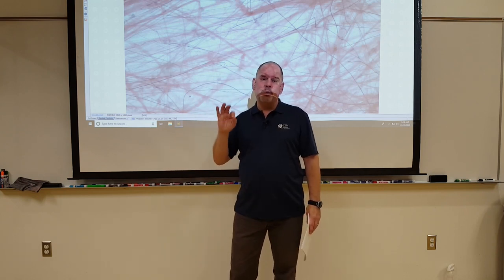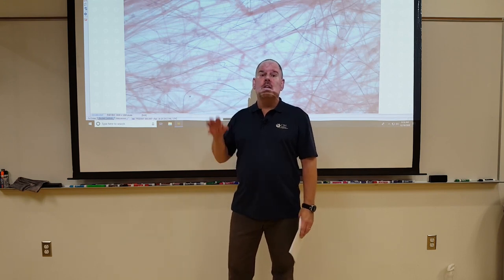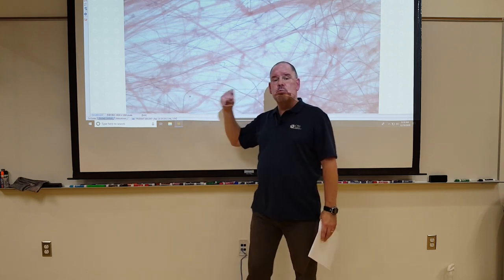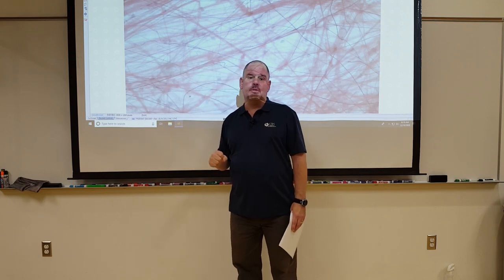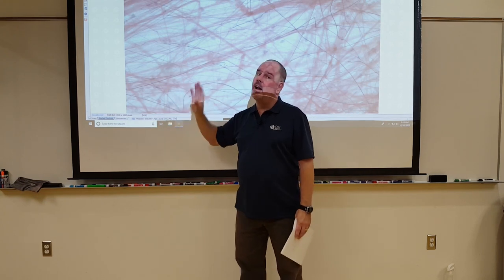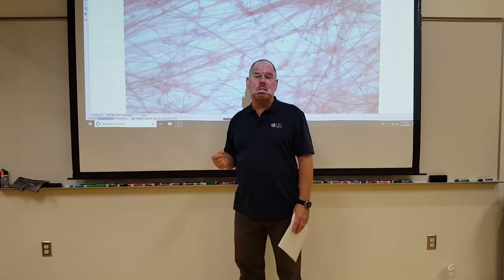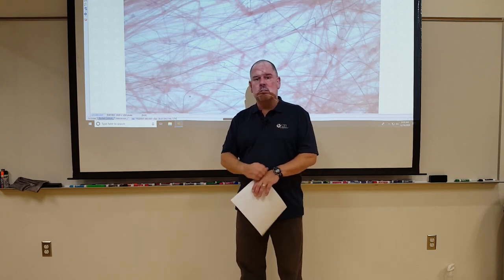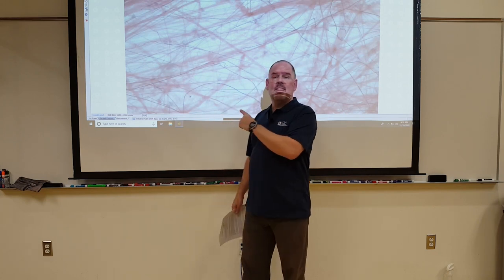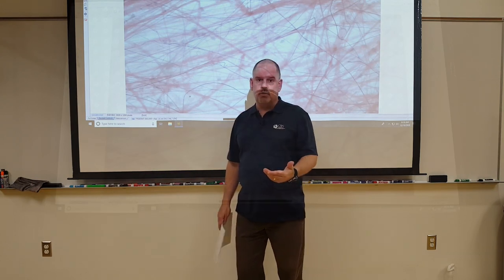So be very particular, be very detail-oriented when you make your drawing, when you look at these tissues, to look for those things that make, say, this one look different from other connective tissues. Generally speaking, many of them get stained some shade of red. Not all, but many of them do. So you want to be careful with that and focus on some of these details, how these tissues look different from one another. So let's start with this one, which happens to be areolar connective tissue.